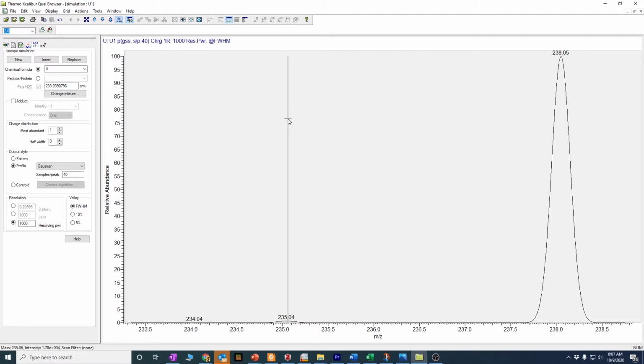So for nuclear forensics, they'll go in and get a swab of something. ICP-MS is so sensitive that they can just look at tiny amounts on a swab, dissolve whatever inorganics are on the swab, and then nebulize it into the ICP torch. And if this 235 isotope peak is bigger than it's supposed to be relative to the 238, then whoever that foreign power is, they're enriching uranium. So this is commonly used by the nuclear forensics community to determine if state actors are illicitly enriching uranium when they're not supposed to be.